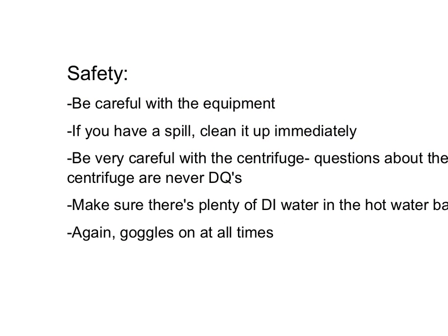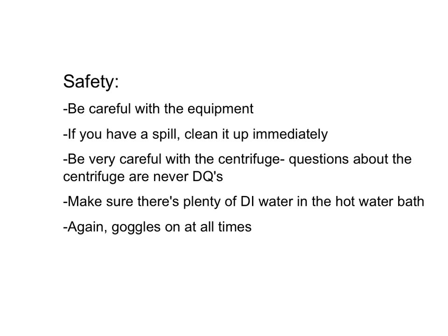Just some more general safety stuff, guys. Remember to always be careful with the equipment during the lab. If you have a spill, clean it up and tell your teachers, so that we know what was spilled and where. Some of the stuff that you're going to be dealing with can potentially be toxic, so it's always good for us to know.